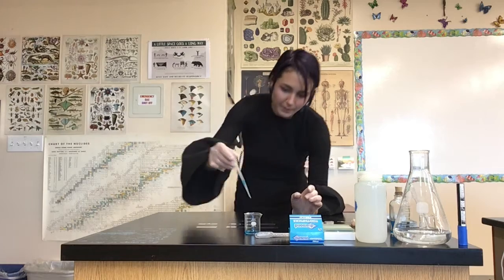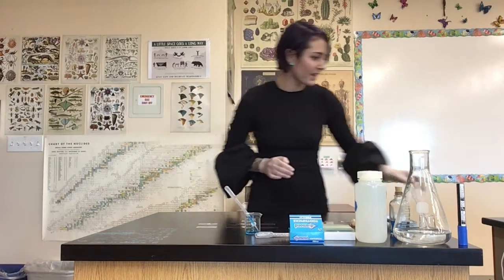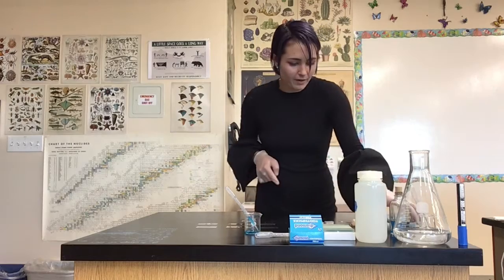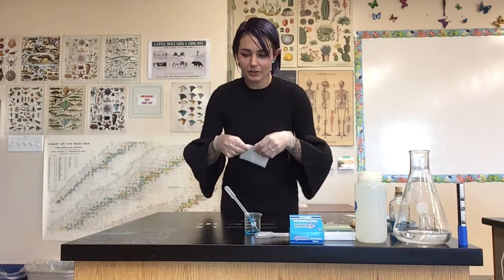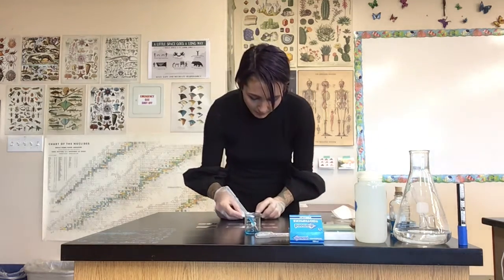There goes my timer. Perfect timing for us to soak up this hydrogen chloride. Let me set the timer for 1 minute because I remember I need to do an extra minute for the actual part of the garlic. So what I'm going to do is just blot up the hydrogen chloride so that we can stain it with the methylene blue.